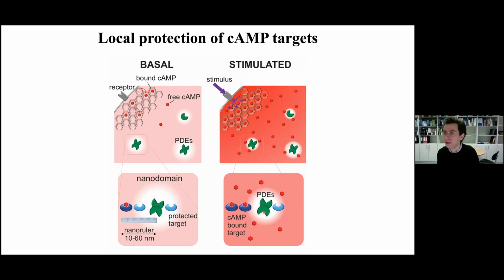Okay, so this was new, and I would say it's only thanks to the ability to finally visualize with a good fluorescence analog cyclic AMP dynamics within living cells that it was possible to address this, which was, I would say, really a truly open and highly debated question.